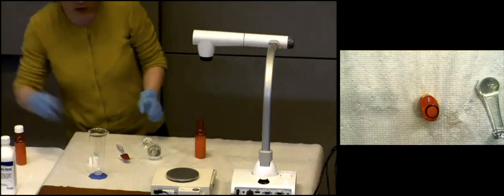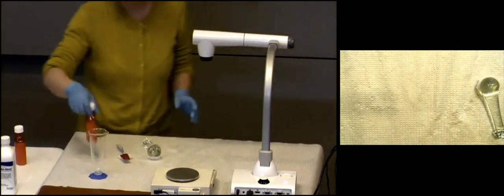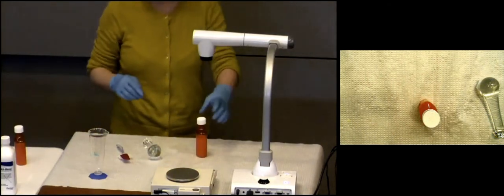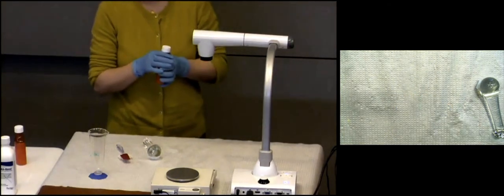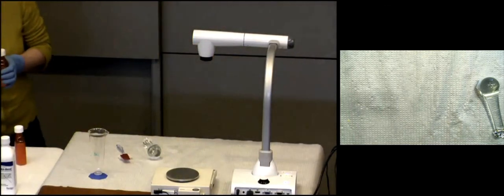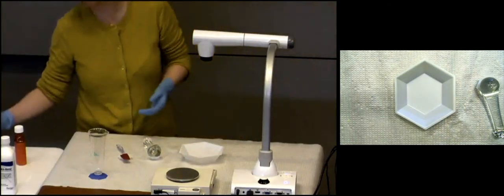All right, so I finished making my suspension. How did she know how much to pour it to? Did she use a graduated cylinder? No. Can you measure in the bottle itself? As long as you go to an exact marking. You can't estimate between two markings, but if 80 mL has a notch, between a 70 and a 90, there's a specific notch there, you can certainly use it to measure. Okay, so I made my product. I made it probably in the early morning, when nobody was there.